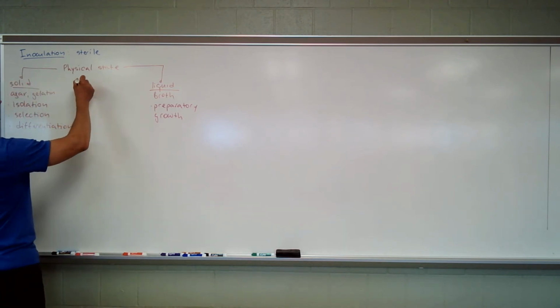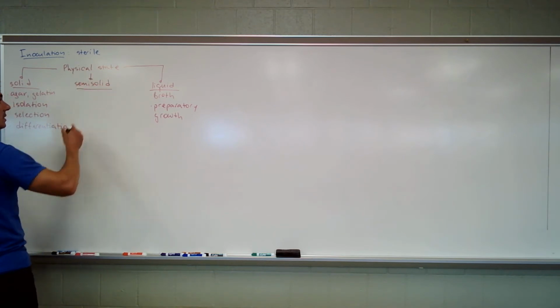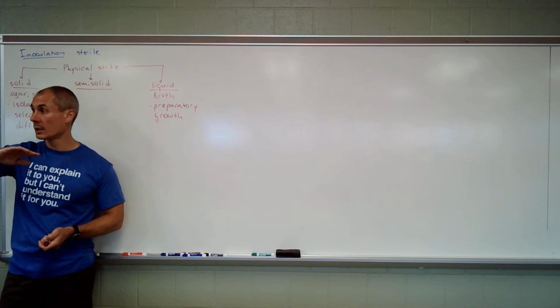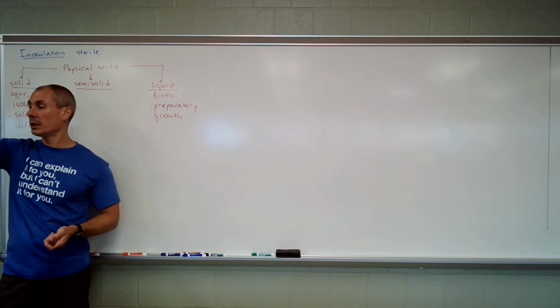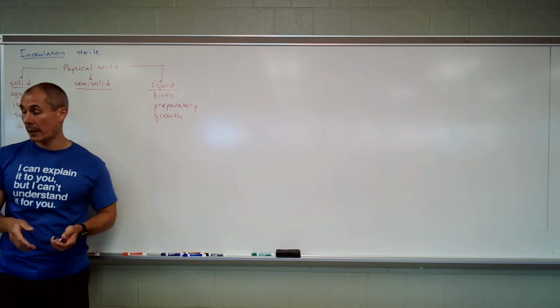Between the solid and liquid is semi-solid. It looks like a clot, really. Okay, there's no solid surface. It's not liquid though. So if you flip the tube with a semi-solid medium, eventually it will get out of the tube, but it'll take days.